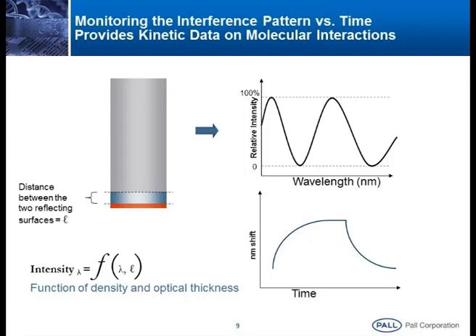So, when we say kinetics, most people do label-based platforms, kinetic studies like ITC, and people do ELISA-based methods, but all the other methods only give an affinity constant. Suppose I can plot a sigmoid like this, and at the midpoint, the IC50, what we call affinity. There are equations to calculate the affinity, but label-free platforms are the only instruments which give the on rate and the off rate values. None of the other instruments give the on rate and the off rate.